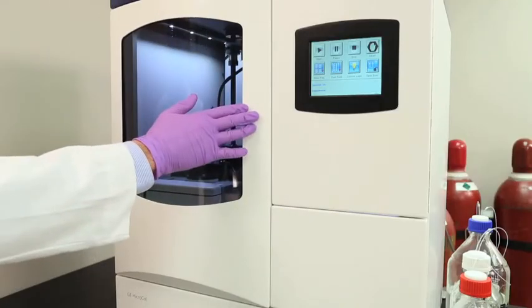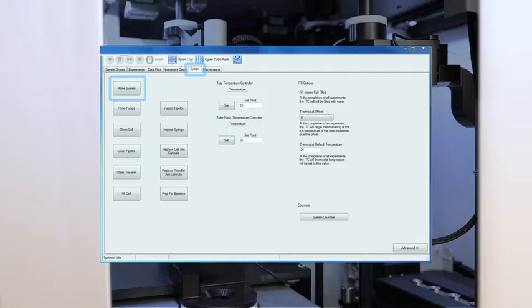At this point, the user would close the instrument's door and click the home system button in the control software's system tab.